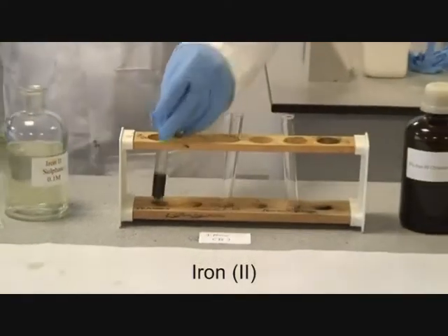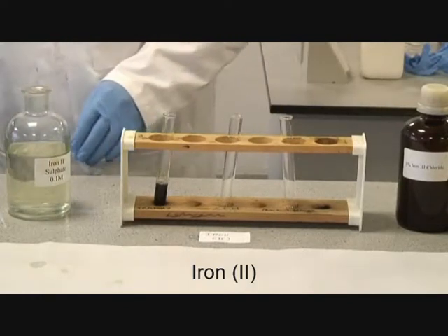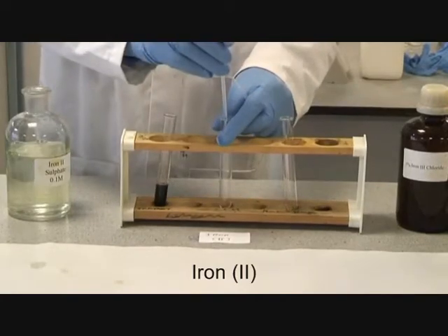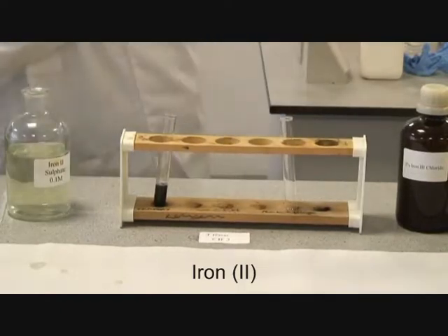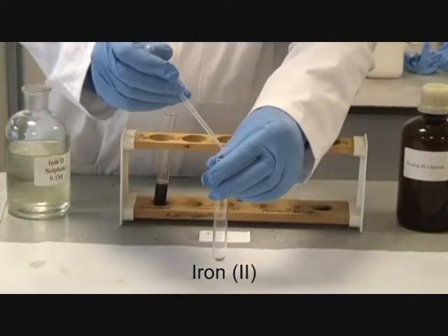No further effects. The addition of ammonia to iron 2.